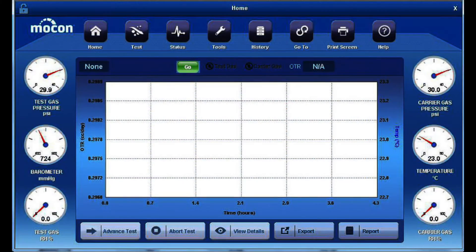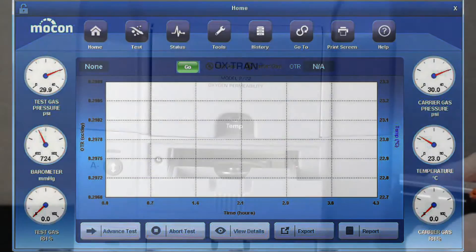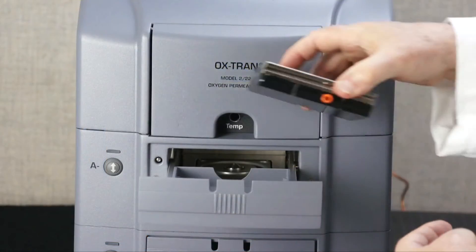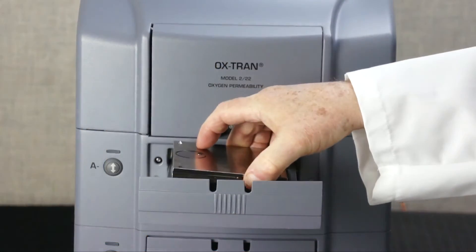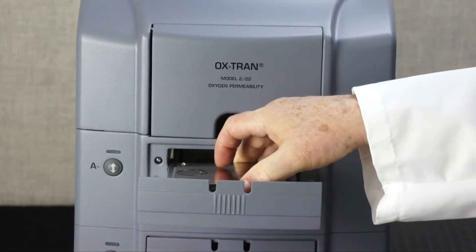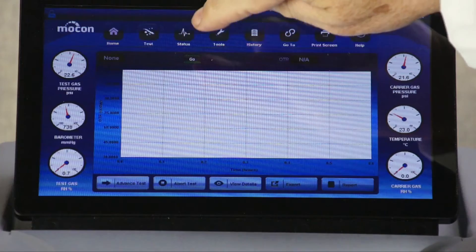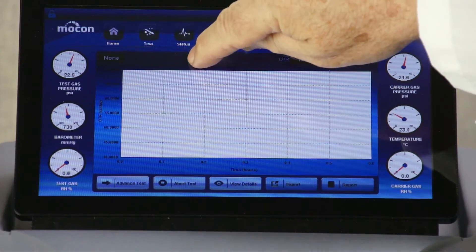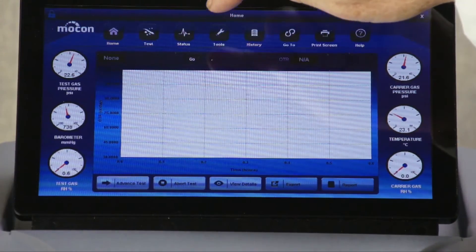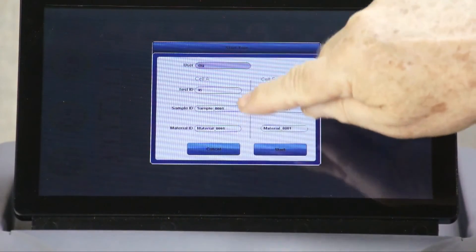The quick start go button enables you to use the same conditions to test different samples of the same film or test different films using the same conditions. You start a repeat test simply by placing a sample into the cell drawer, press the go button, enter a new test ID, and start the test.